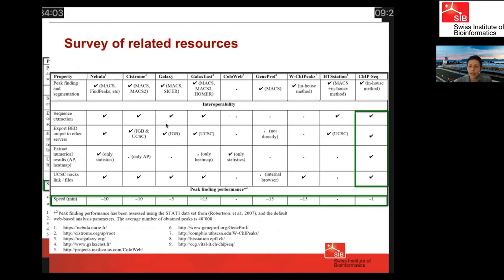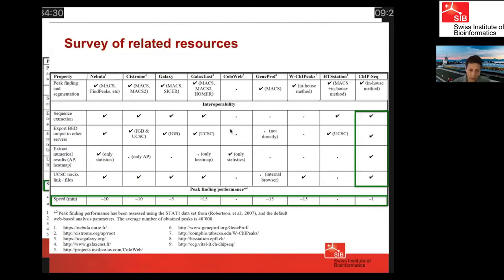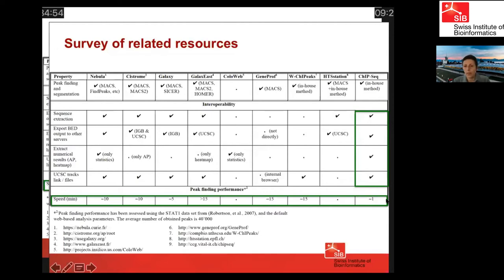We did a survey comparing similar resources in the field when we published our tool, focusing on web-available resources such as Nebula and Galaxy-based tools that accept read alignment files in BED and BAM formats. I would like to highlight the performance of our peak caller — it can scan an entire human genome assembly HG19 with default settings for peak calling in less than a minute, whereas other tools take several minutes.